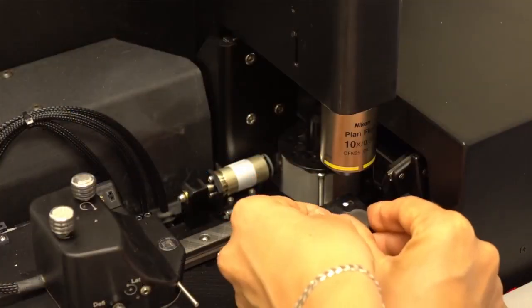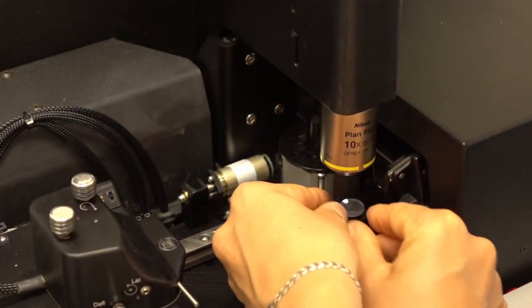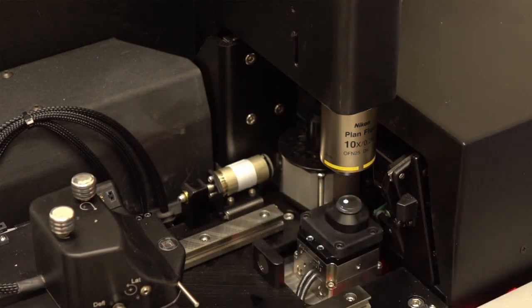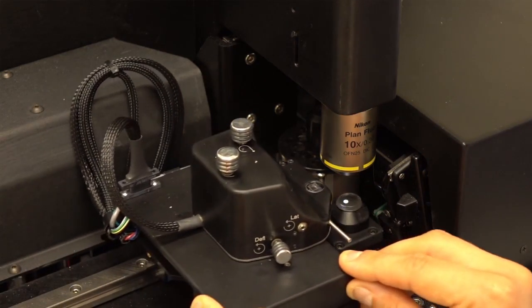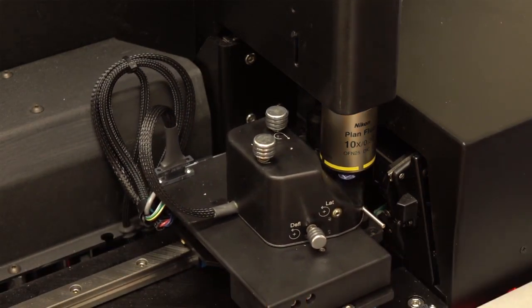By providing insight into antimicrobial resistance, the method can help identify and test molecular targets for new antimicrobials.